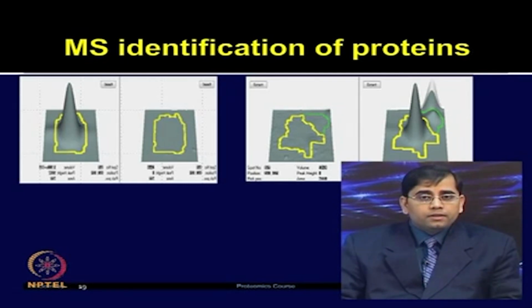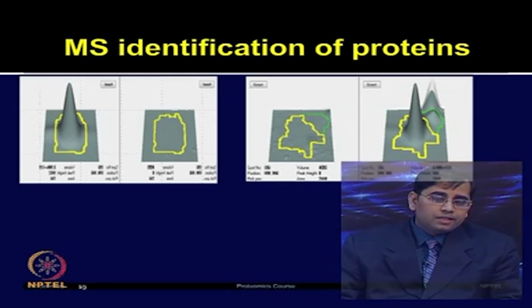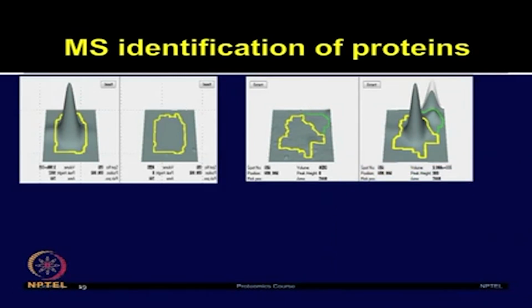They also found 8 proteins which were overexpressed, and those included pigment epithelium derived factor, alpha-2-HS glycoprotein, complement factor H related protein and leucine rich alpha-2 glycoprotein. For the complete list of the proteins identified, you can refer to this manuscript. These are some of the interesting proteins which authors identified.